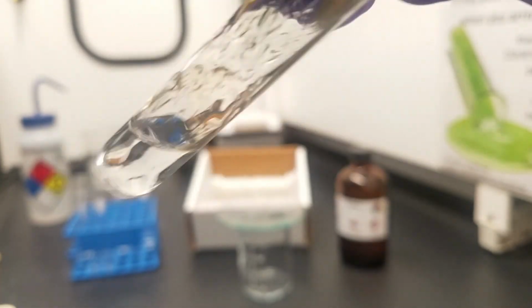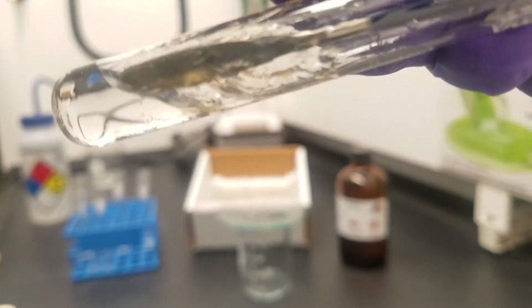And that's what we're looking for here. It's not the easiest to work with, but hopefully you can at least get some idea of its solubility in this kind of weird honey-like mixture.